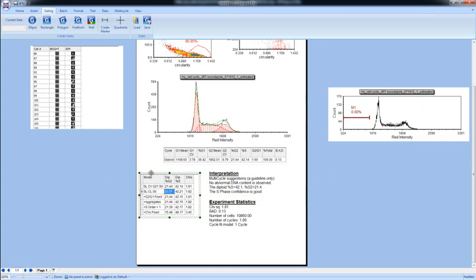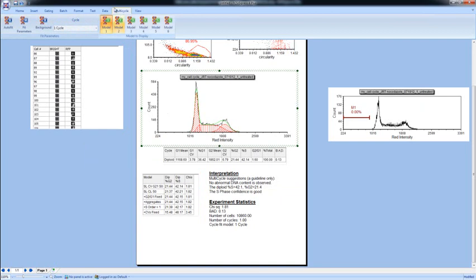We then also have a model summary statistics table, where we have six different models that you can choose from in FCS Express for modeling cell cycle data. And you notice when we click on the Multicycle tab, these six models are available up here. What this table is telling us is that since the diploid and %S numbers for most of these models are very similar, this data is going to fit any of these five models equally, except for this last model where we use fixed CV values, and that's going to fall outside of our range of working with this data in that model.